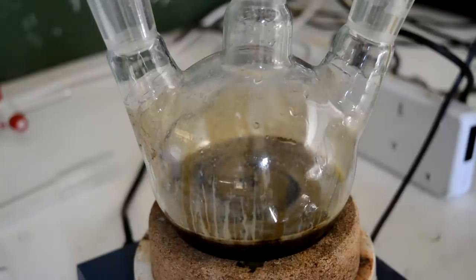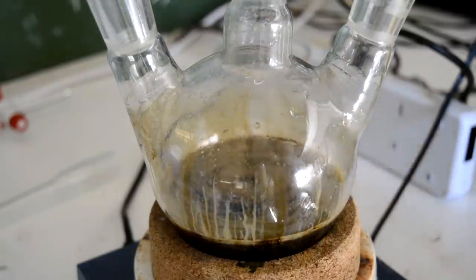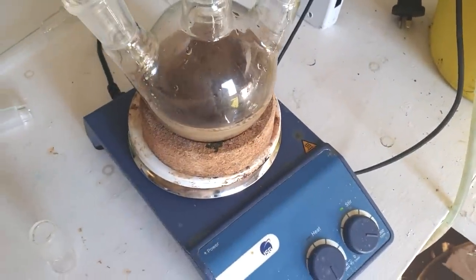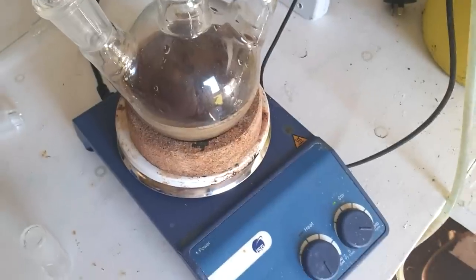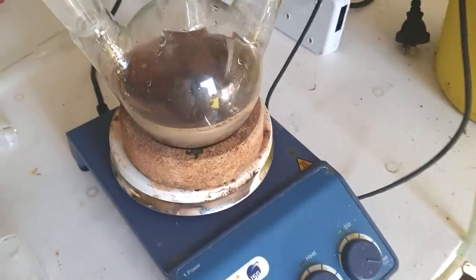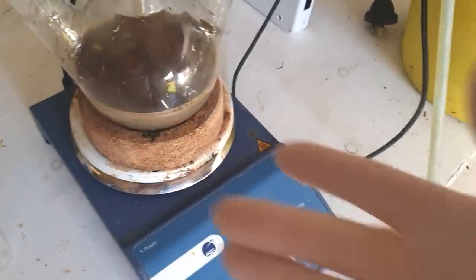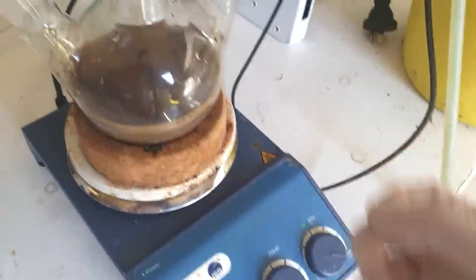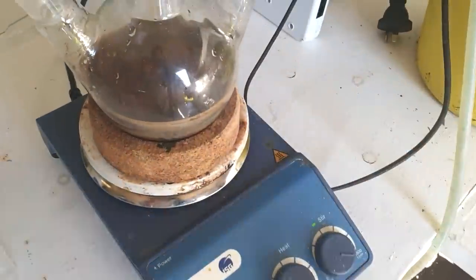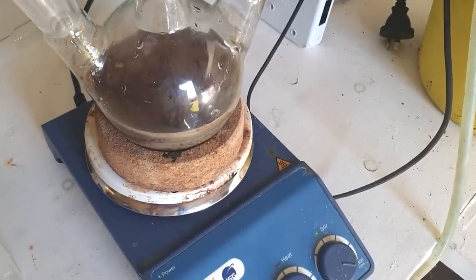It's gone this milky coffee kind of color. And I think that's because the paratoluenesulfonic acid, PTSA, is precipitating out as a hydrate. Wow, I really need to learn some chemistry. And PTSA hydrate is precipitating out. We don't want any of that solid, really. We're going to have to think of some way of removing it.